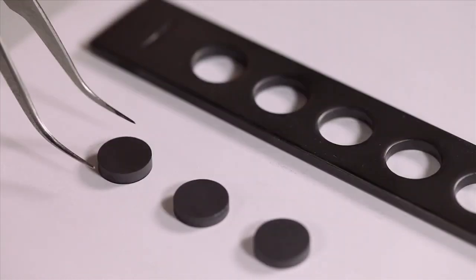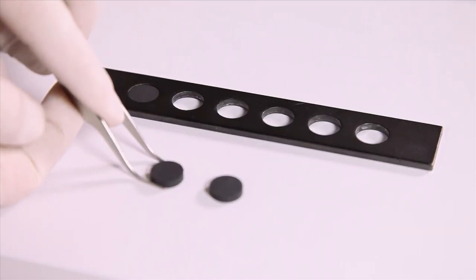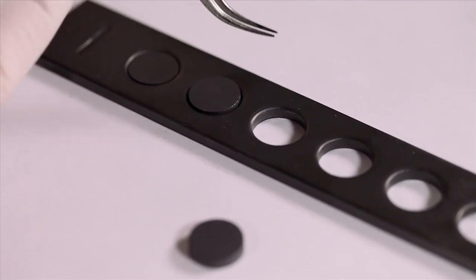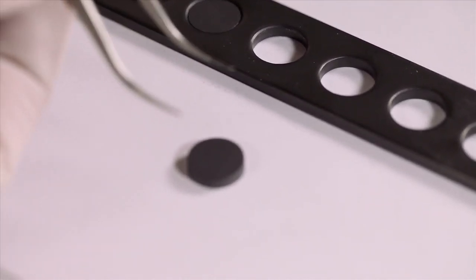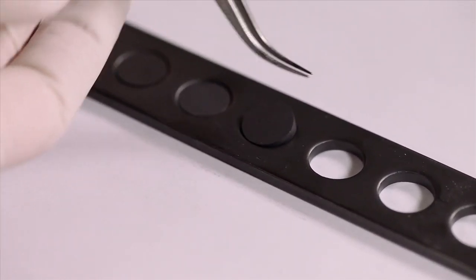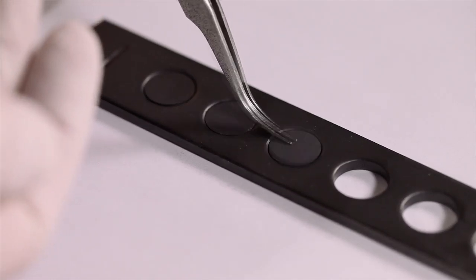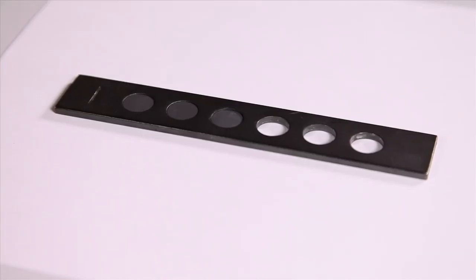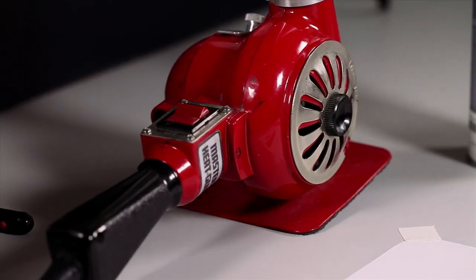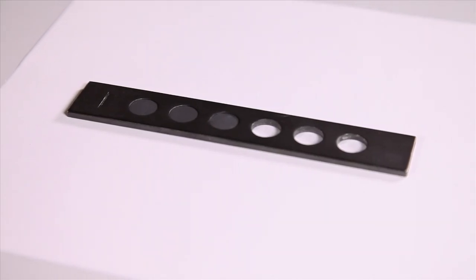First, I put each sample in this sample holder. After I put the samples in the sample holder, I will use a heat gun to heat them to make the solvent in the graphite spray evaporate more easily.